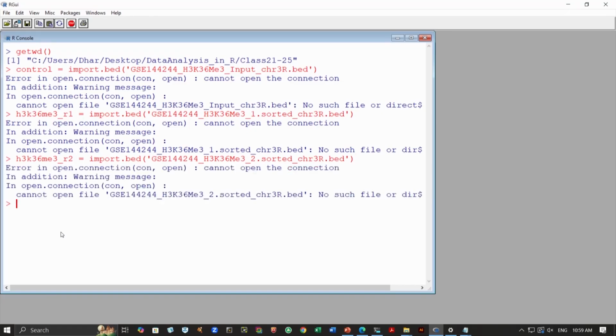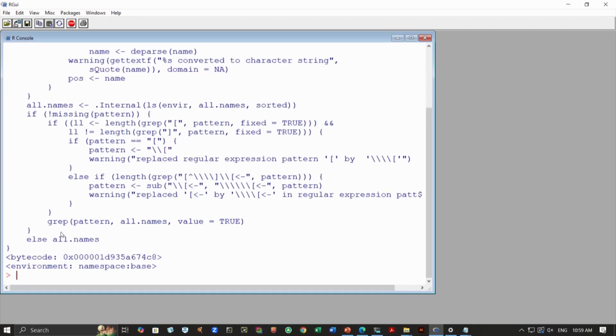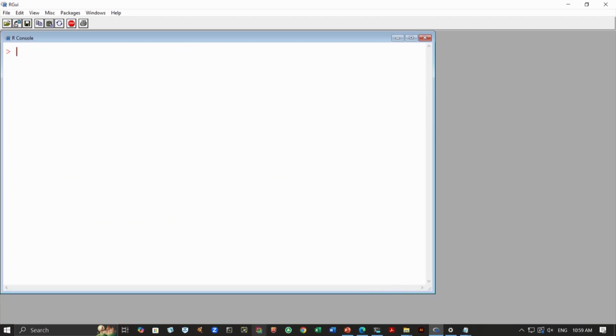Okay. So, it seems within that, again, these files are not here. So, that is again the problem. Let us see, analysis from BAM, this is where the data set is. Okay. And let us run this now. Yeah. So, we were not in the right directory, that is why I could not load them.